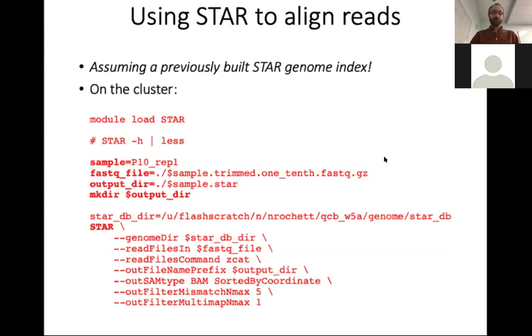So you have two ways of using it. Either you type in the entire path to the program, like this. That's going to directly use it, so this is the help of star, so it worked. It started. Or you can do path equal this directory, $path. This is the other way.